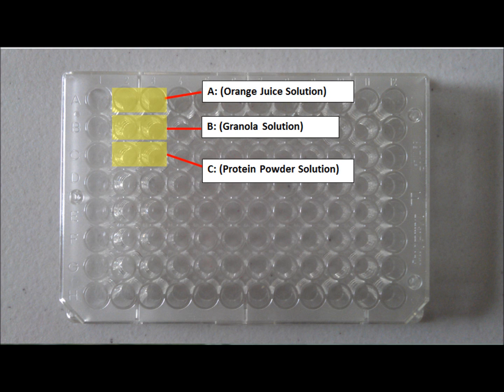In our case, we designated ours in letters. A would stand for OJ, B would stand for granola, and C would stand for protein powder. Solutions A, B, and C are placed in their respective wells, as you can see.